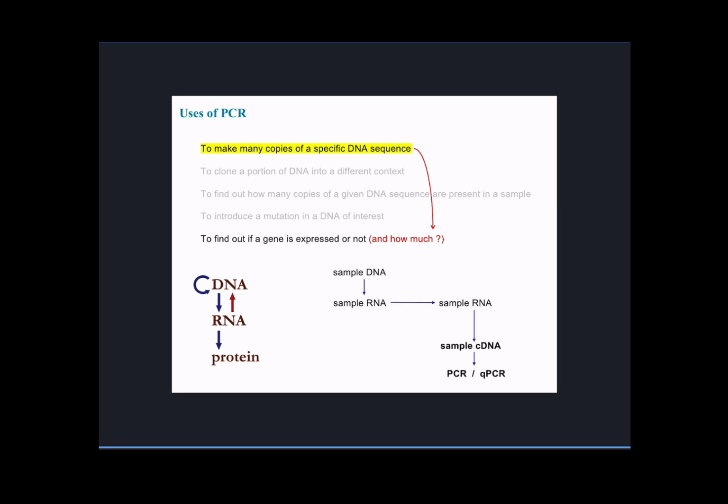This is what is normally known, you'll see this in books and talks and literature, as RT-qPCR. So the RT here stands for reverse transcriptase. Right? So it's indicating that there was this process of making cDNA out of RNA molecules. The Q is for quantitative, and the PCR, of course, for PCR.